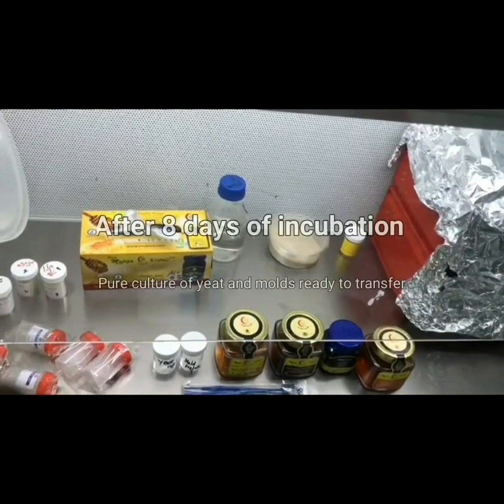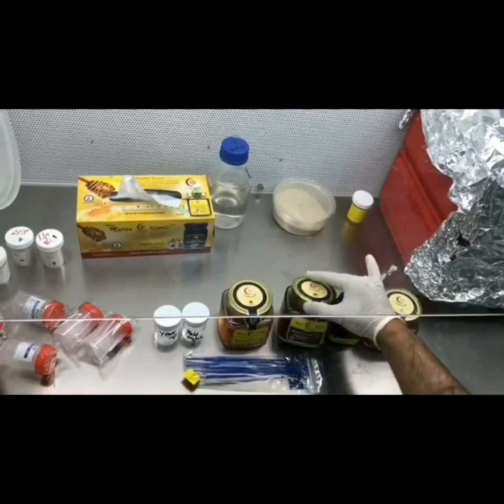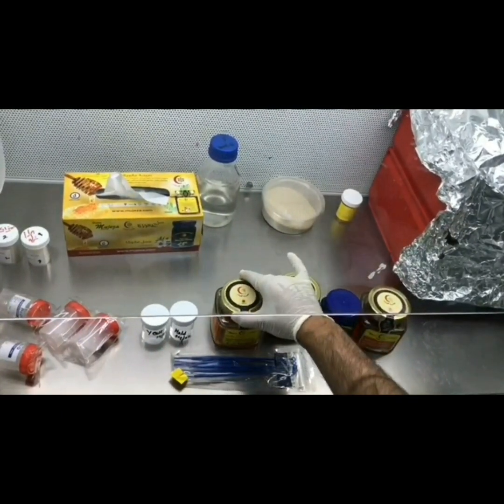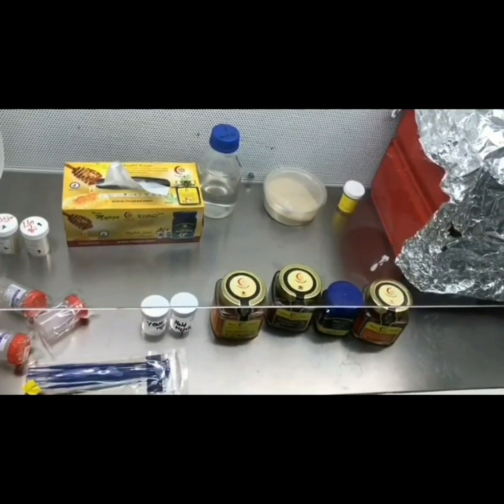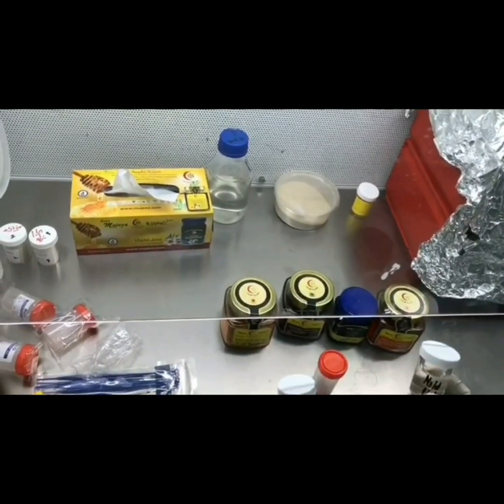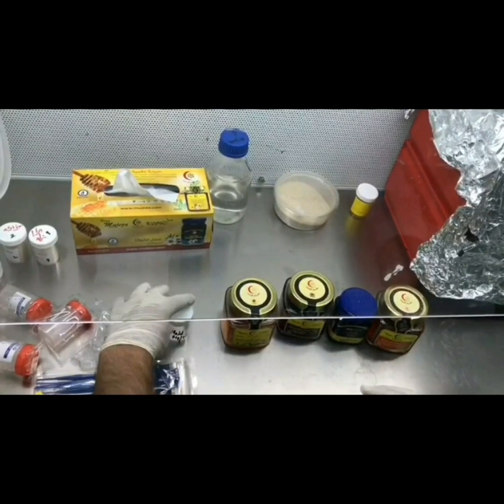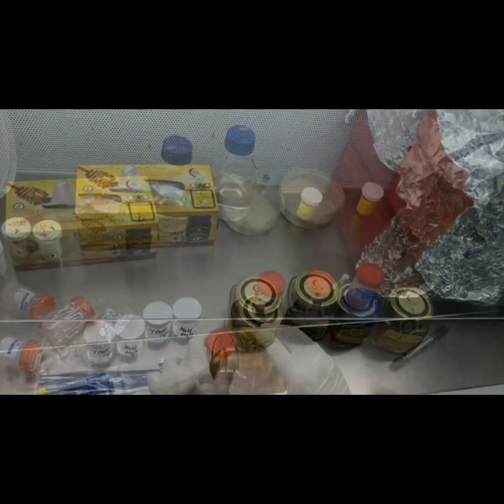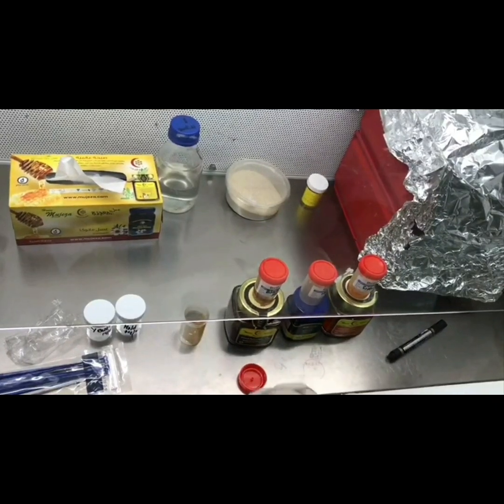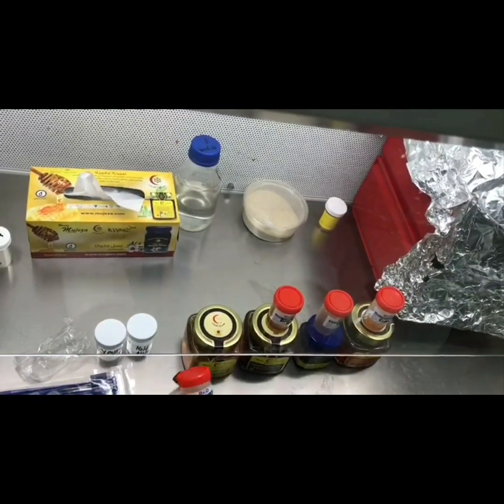These are the products of Muajaza: the honey — manuka honey, habbatus sauda or black seed honey, wild flower honey, and this is multi-flower honey. Now I'm going to transfer all this honey into these containers.